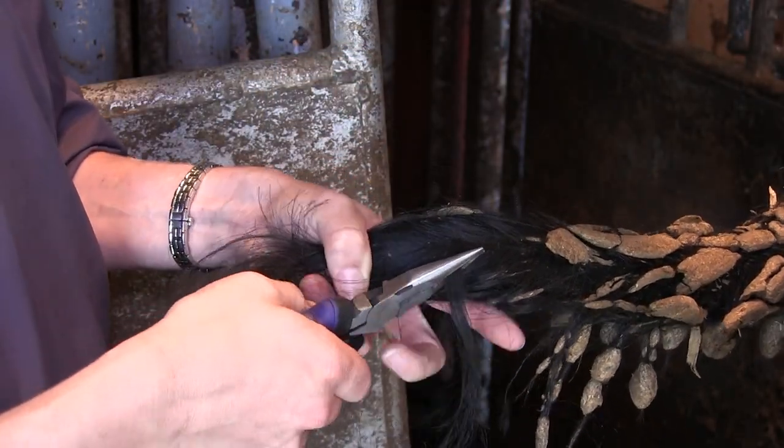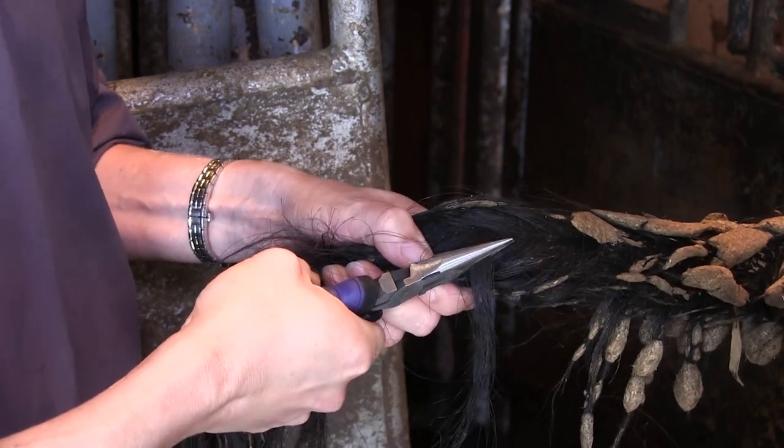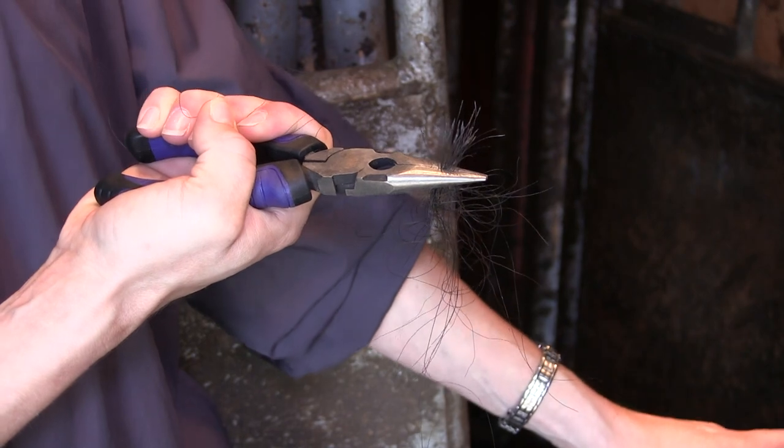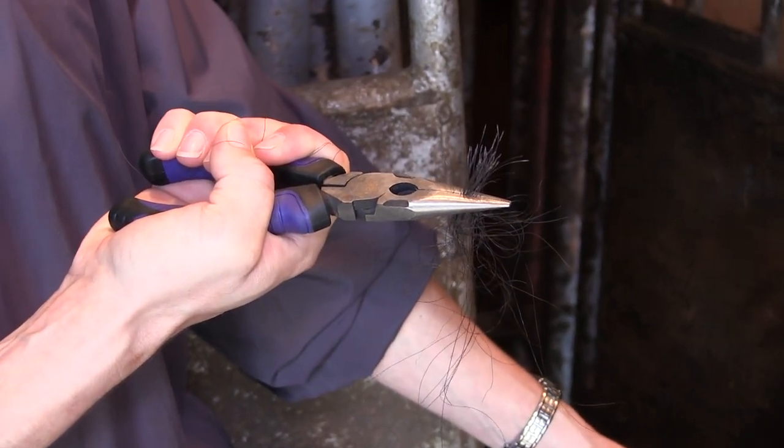Use bent-nosed, long-nosed, or needle-nosed pliers to pull the hair. Place the pliers close to the tail and pull the hair directly away from the animal, not at an angle.